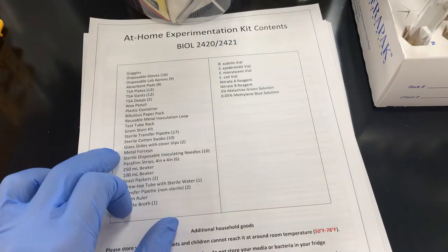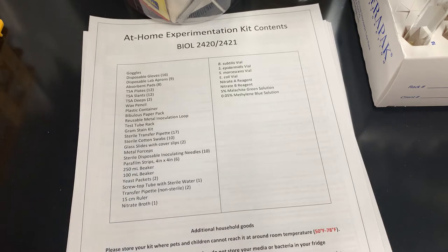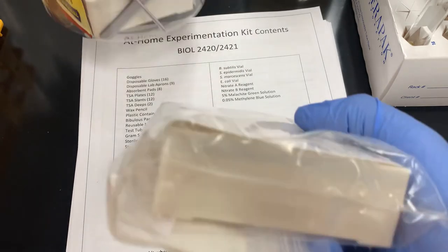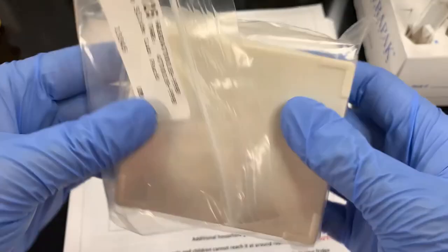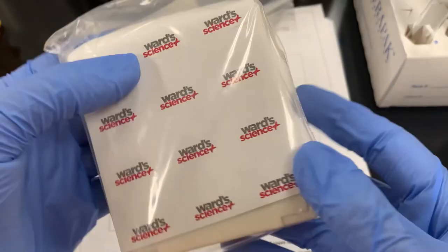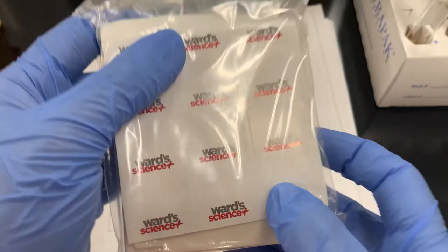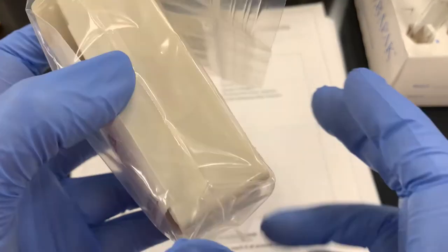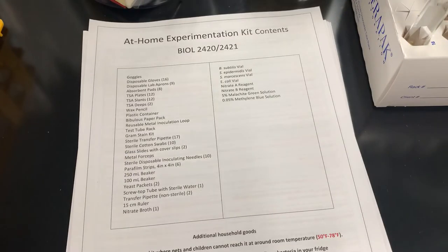Next we have glass slides with cover slip. Now, you're gonna find that in your plastic tub, okay, there's one big white box down here, and here's another one. It's gonna be free floating in your box and your lab kit, okay? Inside here, glass slides and cover slips, and outside of here are stickers that you're gonna use to label the slides. You get two of these, you're gonna use most of them before you pick up the second lab kit.